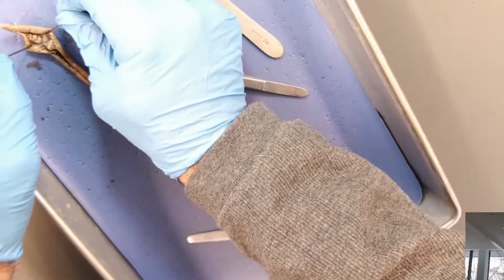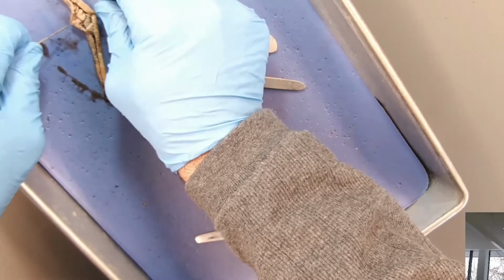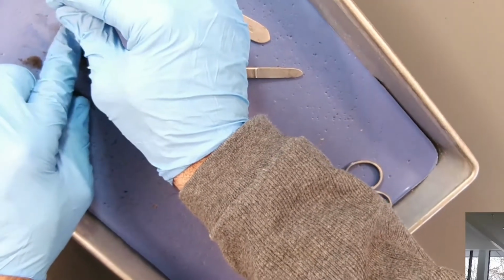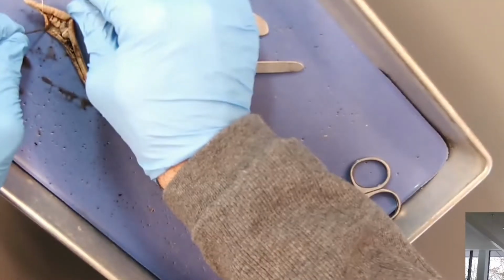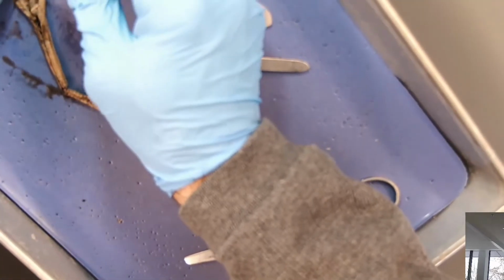Yeah. Let me kick this up. And you have to be a little bit patient with this because it's small and you're trying to expose some of the organs without doing too much damage to them.